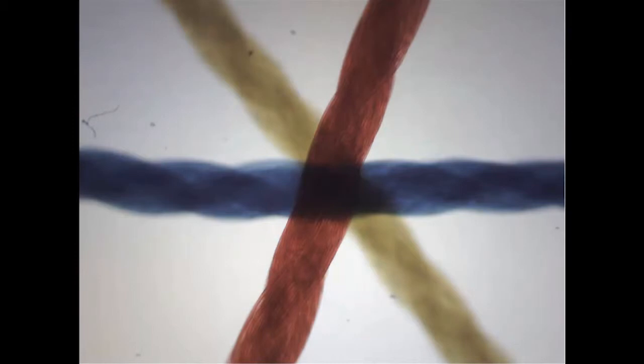I'm going to adjust the adjustment knob until the threads are clearly in focus. Now our threads are clearly in focus and we can see the intersection of the three colored threads on the microscope.